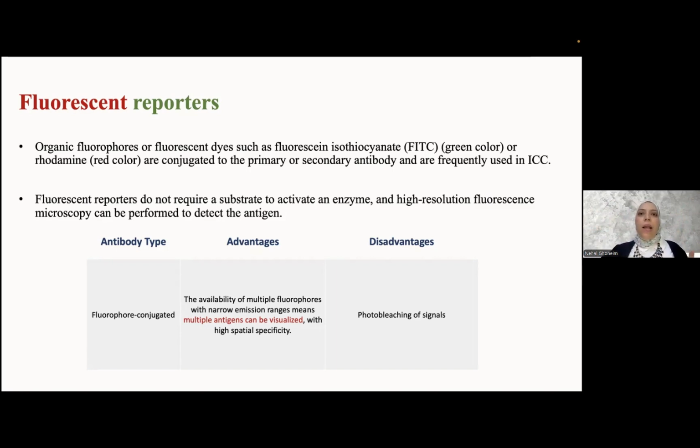And another antibody is co-incubated to detect another protein like p53, the cancer protein, but it is a mouse antibody, so the secondary antibody will be anti-mouse. In the case of multiple antigens, the fluorophore attached to the antibody detecting actin and the fluorophore attached to the antibody detecting p53 should be different, giving different colors.